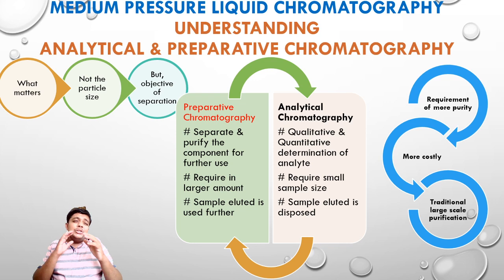Now, these methods of preparative chromatography, which are generally used to separate in larger quantity, to purify in the larger quantity, are good. But when you compare it with our traditional methods of precipitation, distillations, and things like that, at some instance you might feel that they are more costly.